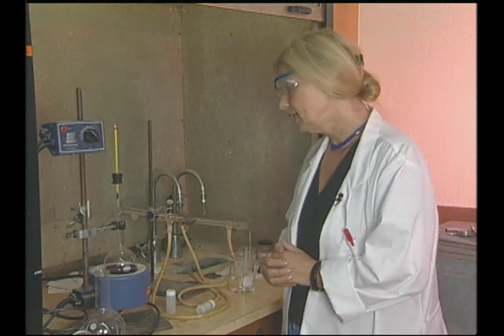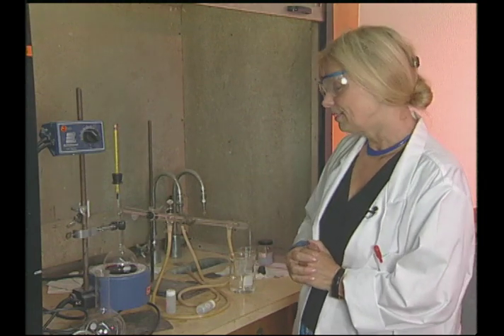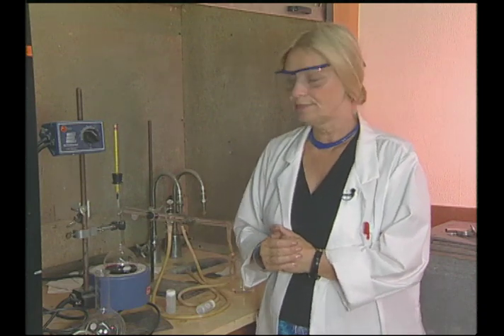In the old days, they used this in the moonshine era, where alcohol was illegal. People had these setups in their backyards distilling alcohol. So we will leave this apparatus for a while and then check on it again to see what kind of progress it has made.